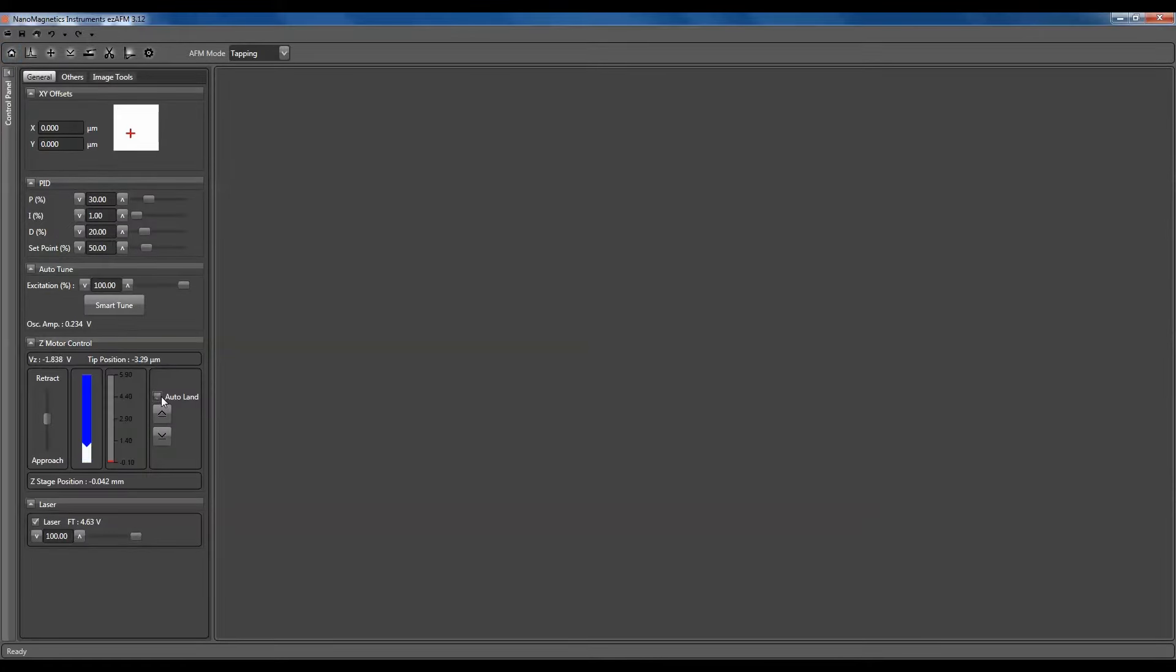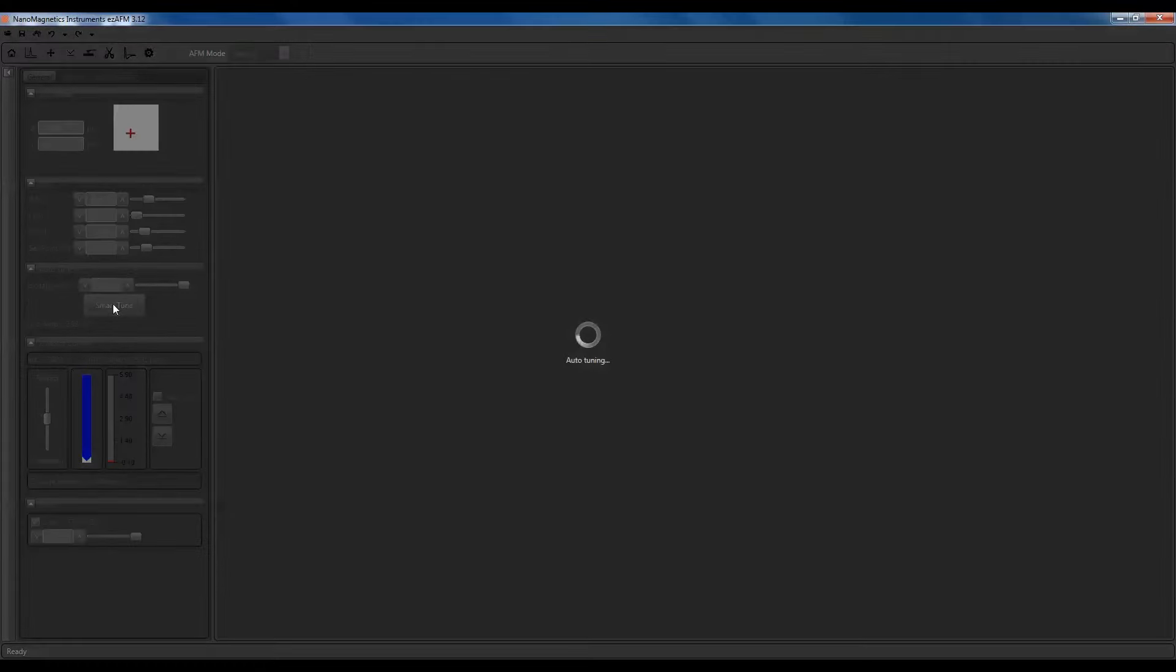After the Auto-land procedure is complete, click the up button once to retract the cantilever. Click the Smart-tune button to tune the cantilever again.